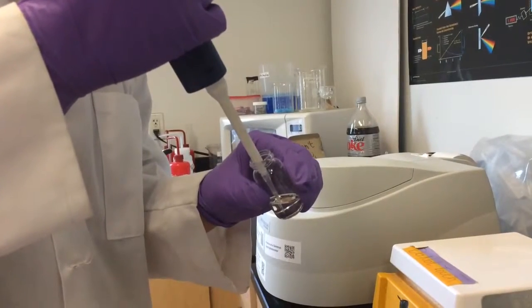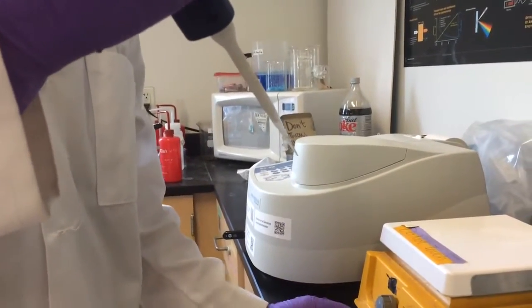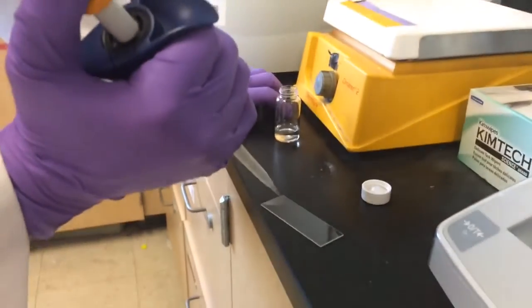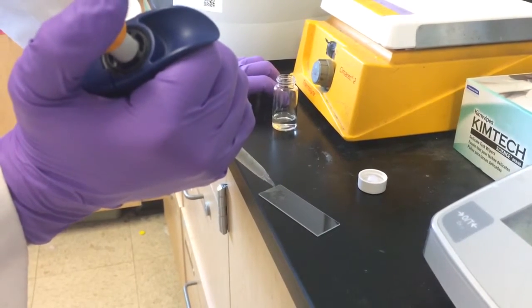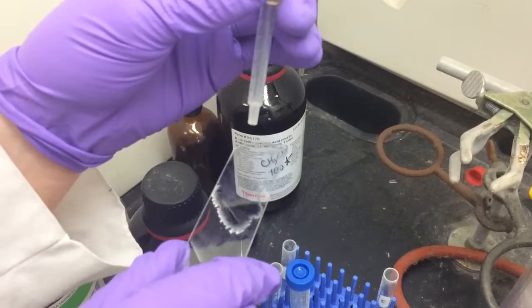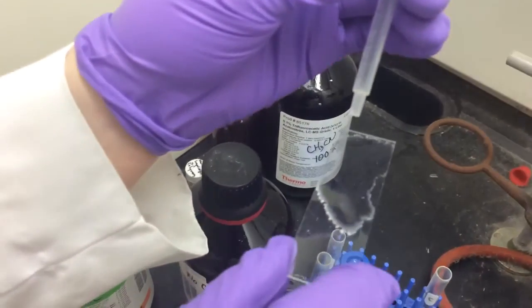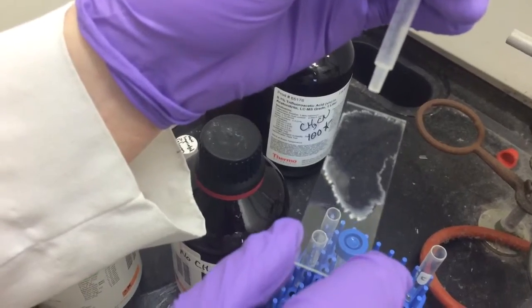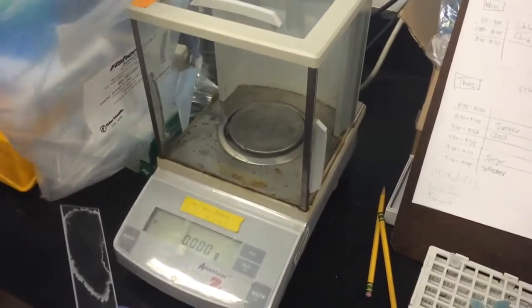Here we are using a micropipette to dispense 50 microliters of our 2% linear PEI solution onto a glass microscope slide to test how the solution will spread out over a flat surface before we use an electrode. We then use nitrogen to evaporate the solvent, so we will be left with only the layer of PEI on the glass slide. The glass slide is then weighed to determine the mass of the PEI layer.